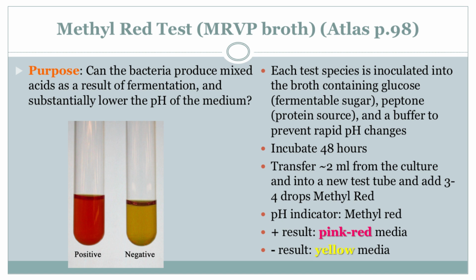Two whole days. Why so long? It gives them plenty of time to break down the glucose, and if they're the type that produce stable acids as a byproduct of that breakdown, to make enough that we can measure it accurately. Makes sense. So after 48 hours, what's next? We take a little sample of the bacteria-infused broth and add a few drops of, you could say, our magic ingredient, methyl red reagent. And this is where things get colorful, right? You got it.